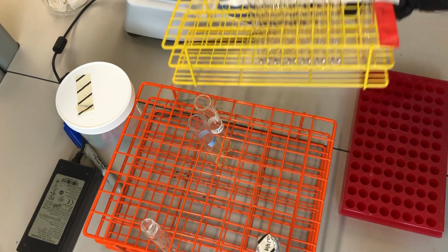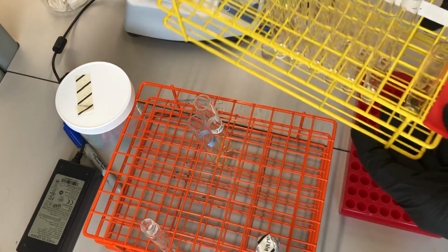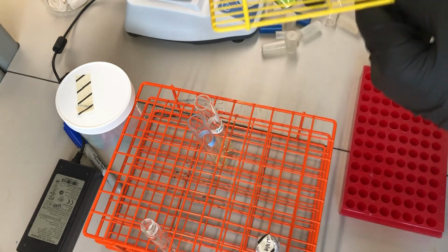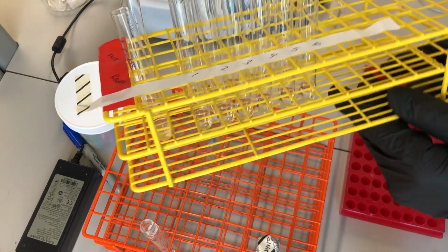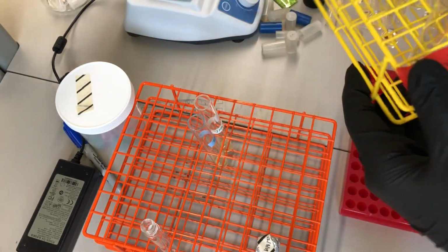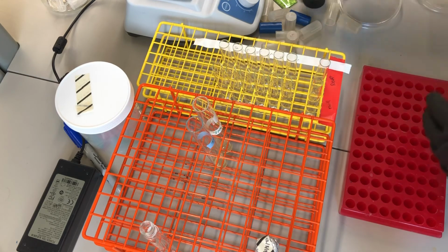And if you do your work carefully, then every tube will have the same amount of liquid. It's easy to detect empty tubes, and it's also pretty easy with some training to detect if you've double filled a tube. So now those dilution steps are ready.